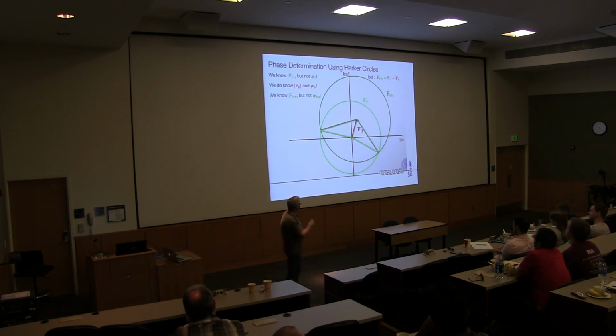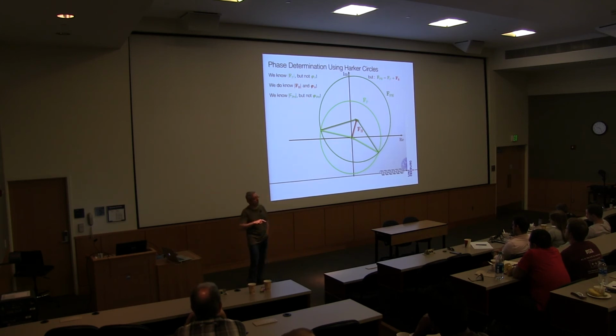And this is pretty much where we're going to pick up in the practical. So we're starting with the diffraction image, and then you're going to go through the entire process of processing this data, identifying the position of the iron atoms, and then solving a structure, and then, if you want, go into model building, because all you get is the electron density map. There is no model in, and that, again, is interpretation.